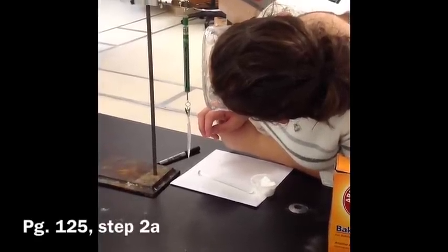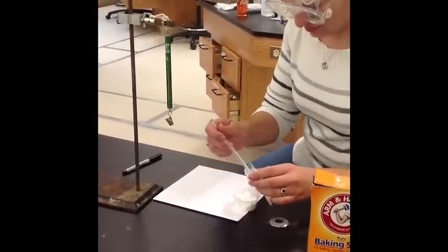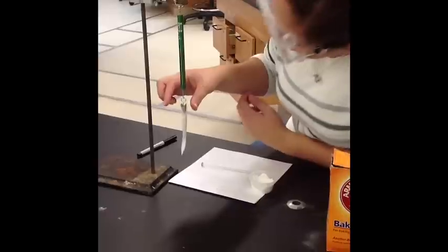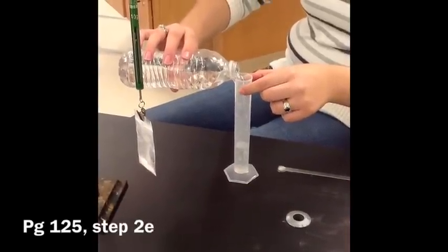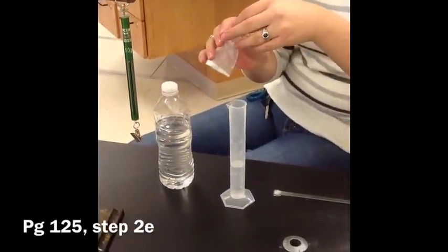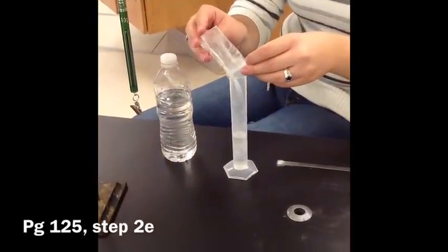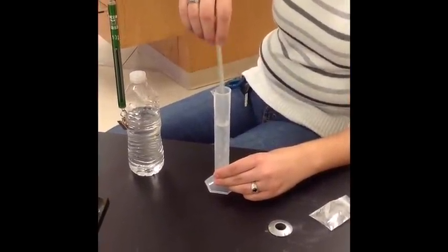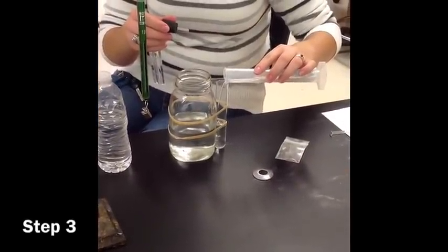Attach the weighing bag to the spring scale and measure the mass of the bag. Add baking soda to the bag until the scale reads enough to account for one and a half grams of baking soda and the mass of the bag. Add about 25 milliliters of water to your graduated cylinder, then transfer all of the baking soda into the cylinder. Fill the cylinder with the remaining water and use the stir rod to dissolve all of the baking soda. Fill the large test tube about 75% full with the sodium bicarbonate solution.